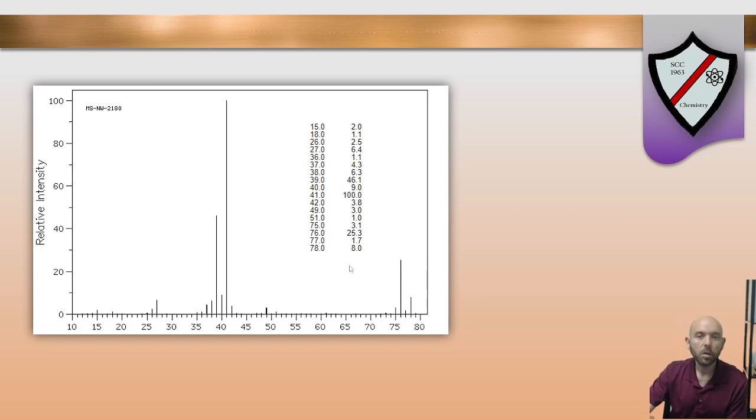And so we would say, okay, it does appear that there is a molecular ion as well as a molecular ion plus two peak in this sample. That means there is probably a halogen present on this molecule. Furthermore, especially from the numbers here, the molecular ion plus 2 peak is about 1/3 the size of the molecular ion peak itself, with a relative abundance of 25.